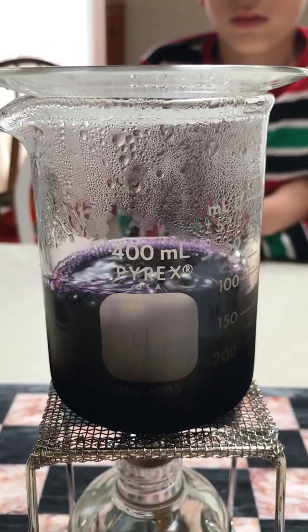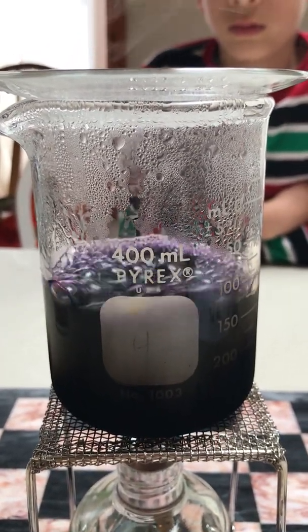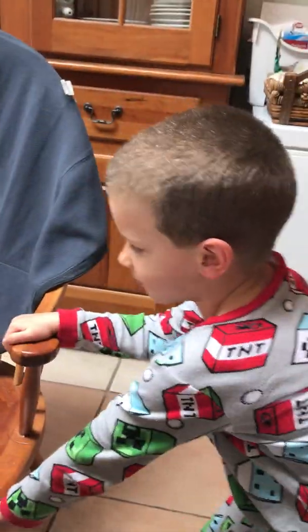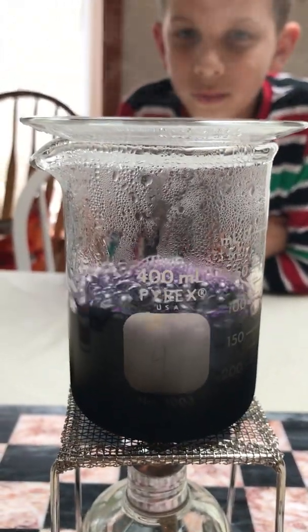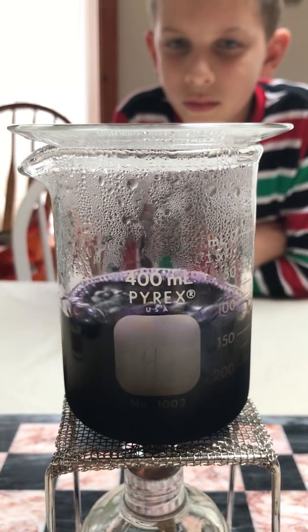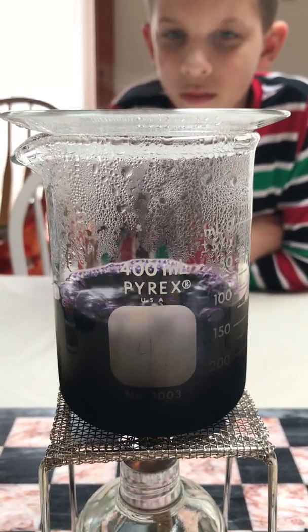Ladies and gentlemen, we are going to do our forensic fiber dye test. Helping me today is James and Liam. Say hi, Liam. Hi. So what we've got here is our forensic fiber dye — a very specific dye made specifically for forensic purposes.